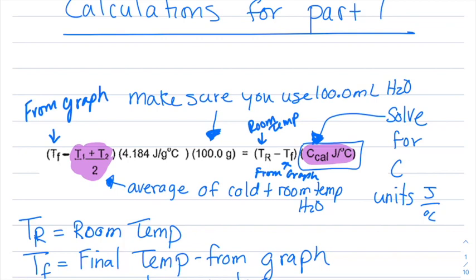The calculation for part 1 is from your lab manual, and it is this right here. I just copied and pasted it. Now I want to show you what everything is in there.